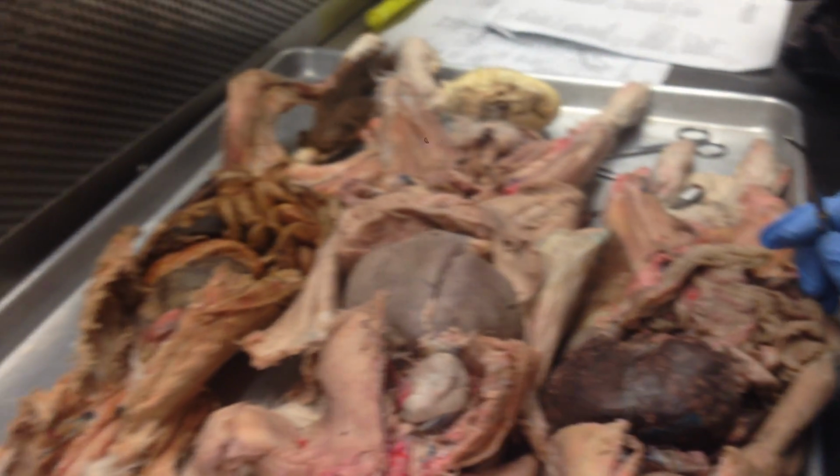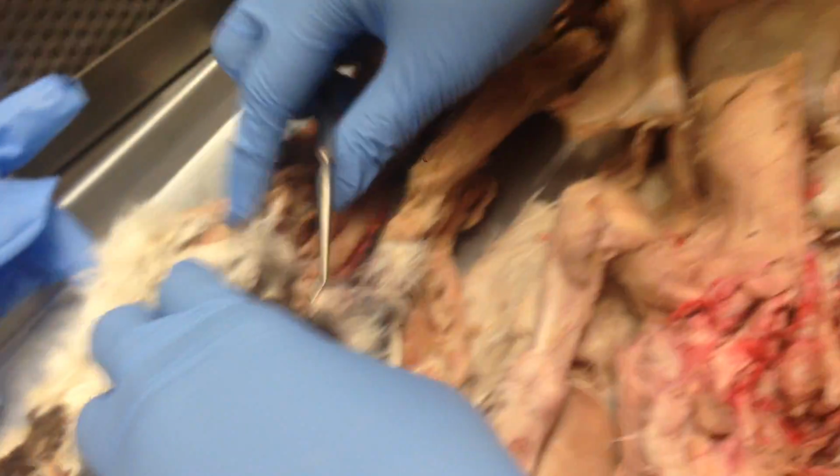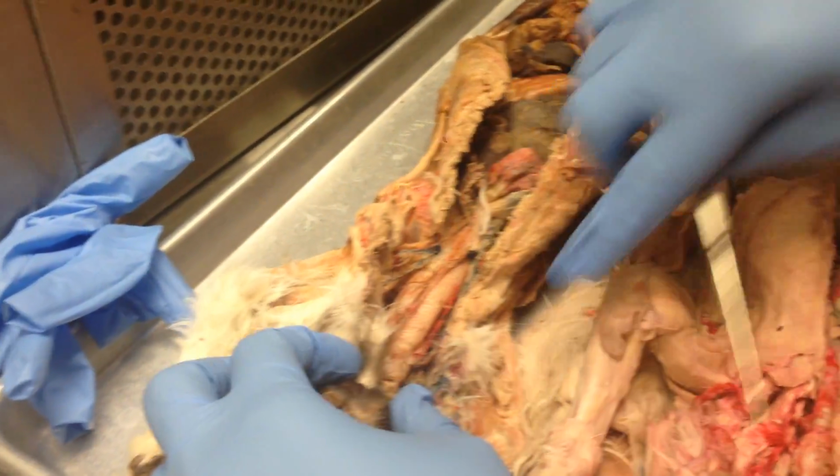The parotid glands are best seen in the cat. They're underneath the masseter. This cat doesn't really show it well, so we'll take a good picture of that later. All right, how about the submandibular?